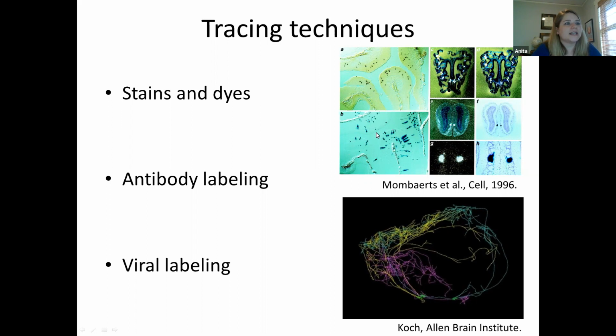So here in A and B, C and D, you can see that throughout, this is the olfactory epithelium, so you can see there's quite dense labeling through here. But then when you actually look at the olfactory bulb where those projections are in the brain, you can see they all converge on a single glomerulus. So this was quite a famous example of how we can use tracing to understand how the brain is doing computations, in this case in the olfactory system.